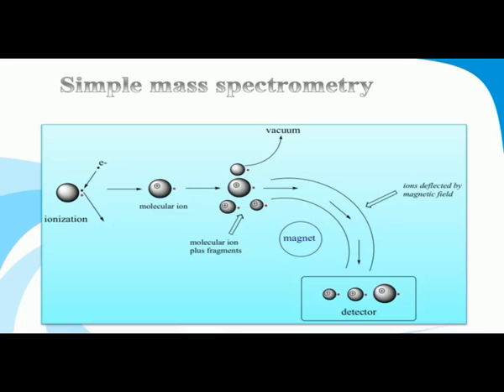The electrodes are placed in such a way that whatever ion is formed, a highly charged ion, the first electrode is of positive charge, then the second is of negative charge, and the third will be more negative than the second plate. So for what purpose are these electrodes placed?